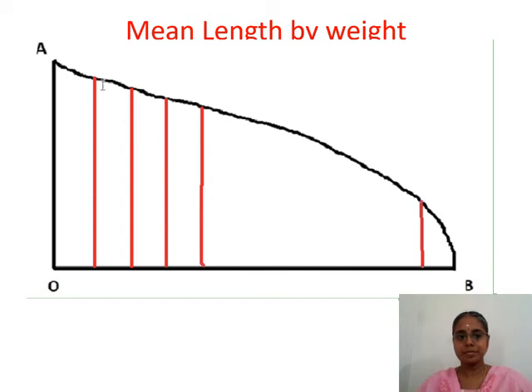So now this is your length L1, and this is your L2, this is your L3, and this is your L4.